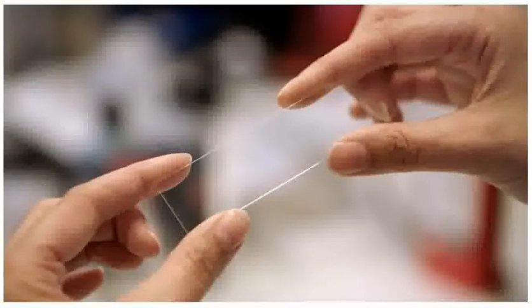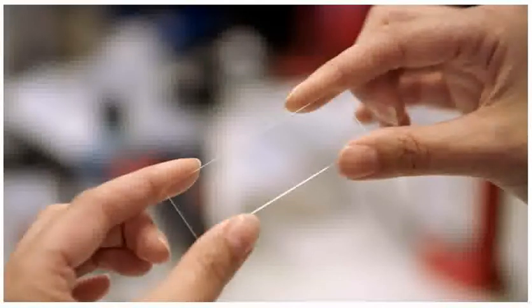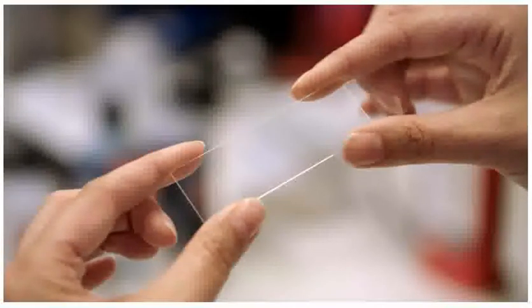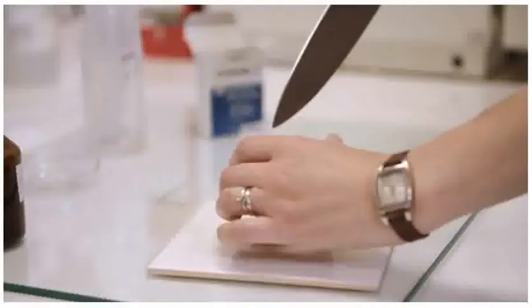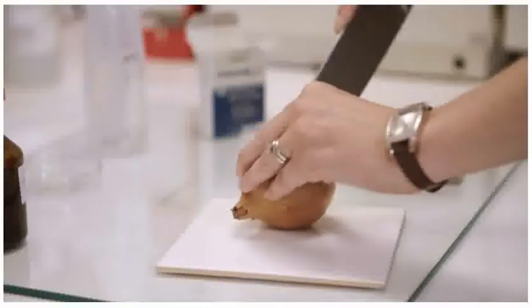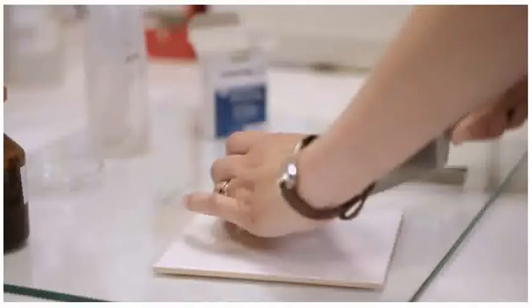Slides and cover slips are fragile. They are held carefully at the edges to prevent breakage and to prevent getting fingerprints on the glass. A sharp knife is used to cut the onion on a white tile. Care is taken when using the sharp knife.